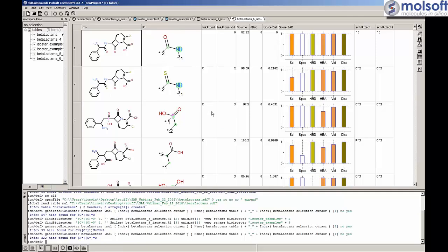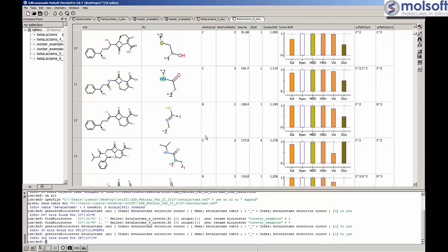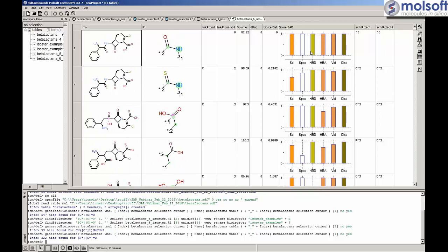So it gives you this kind of spreadsheet where you can analyze your results. For the linker, there is also a distance, the minimum number of bonds compared to your original linker, because for the linker you're not only interested in volume, but also how far these two points are. It gives you a similar spreadsheet with multiple parameter optimization components, and you can go through it and analyze this data.